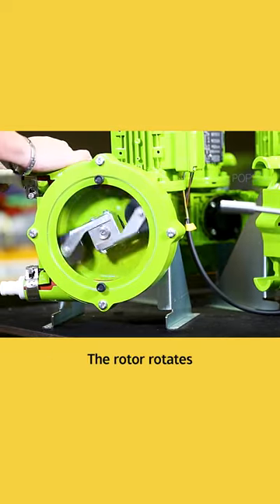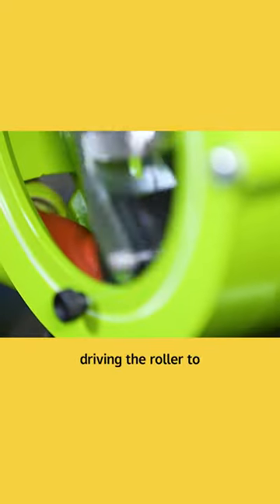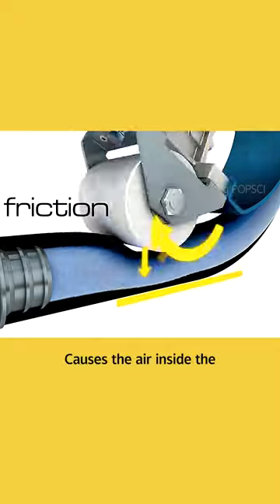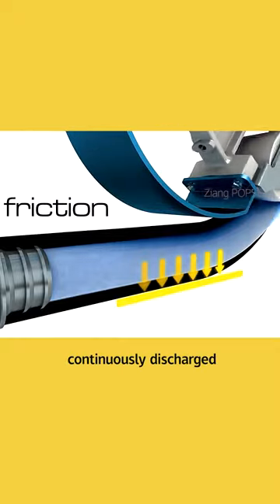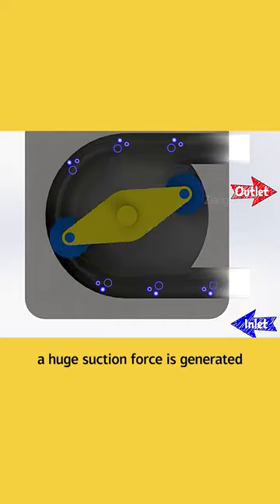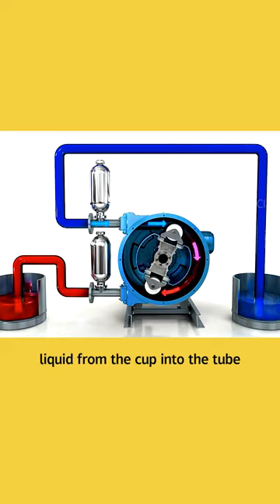Under the action of the driver, the rotor rotates, driving the roller to continuously squeeze the elastic hose — it's like wiping water with your hands. This causes the air inside the pipe to be continuously discharged. When a local vacuum occurs in the rear, a huge suction force is generated, continuously sucking the liquid from the cup into the tube.